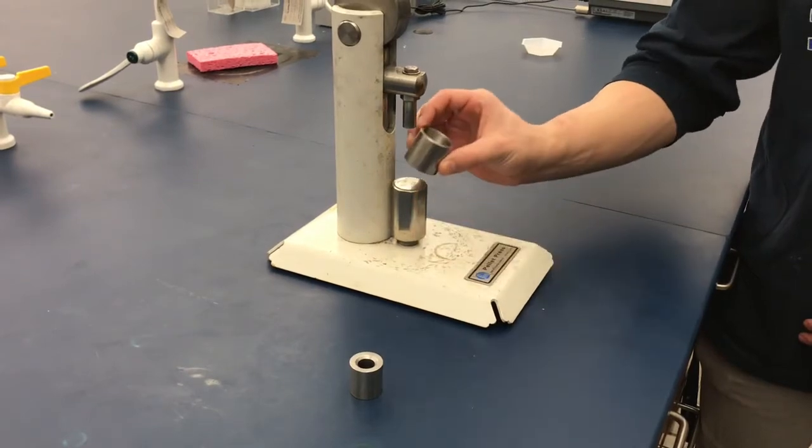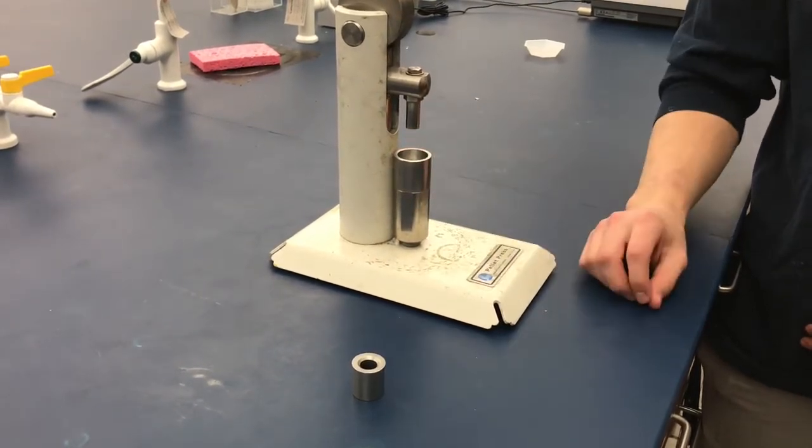Take tube number one and place the side with the beveled edge face down onto the pellet press.